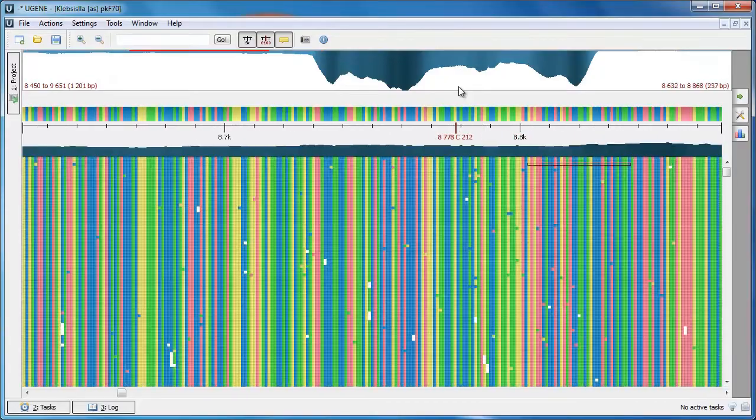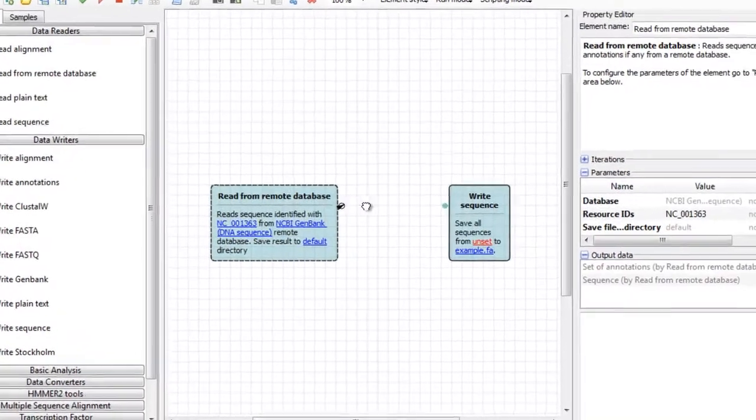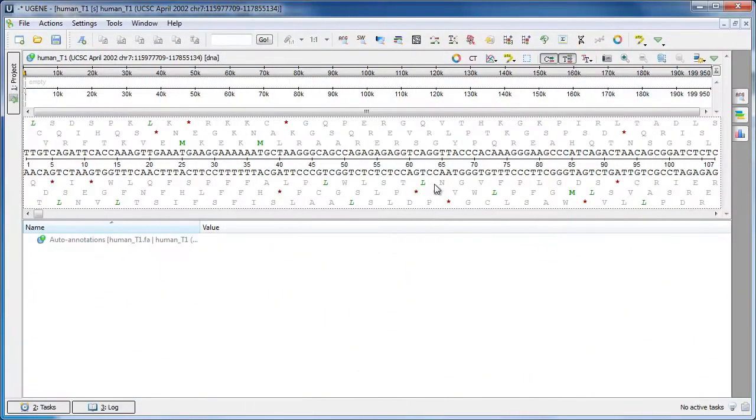Here we discuss the hottest topics introduced by our users and show some helpful tips for using UGENE, a free cross-platform genome analysis suite. A codon table was added to the sequence view.